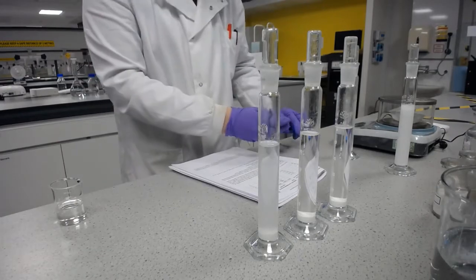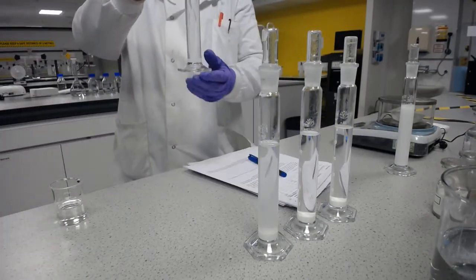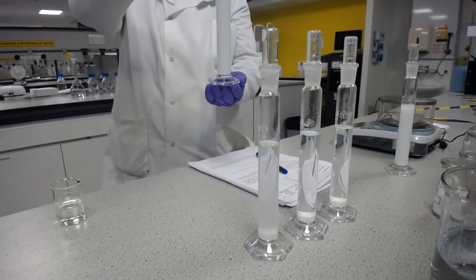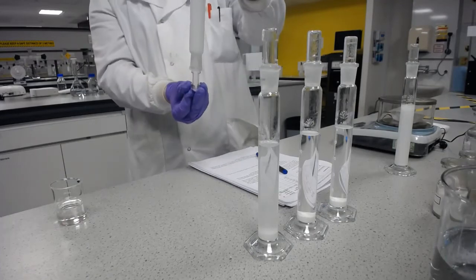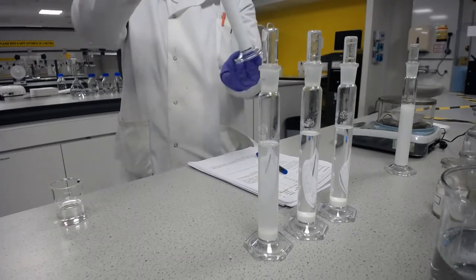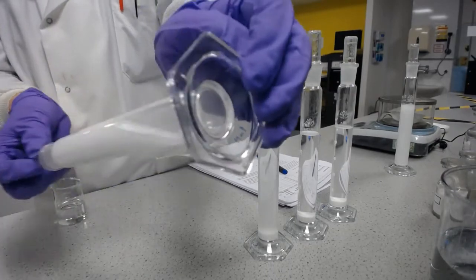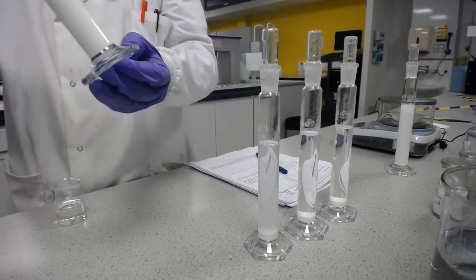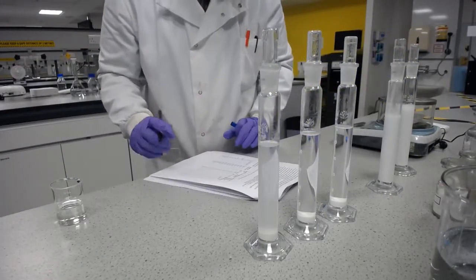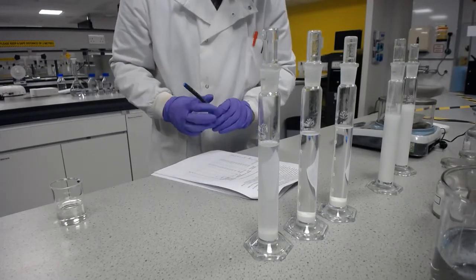And how many inversions is this going to require? Hopefully not as many. 1, 2, 3, and 4, I would say. 4 inversions. You can see there's nothing left on the bottom there. So I'm going to say for that, the 1 millimolar was 4 inversions.